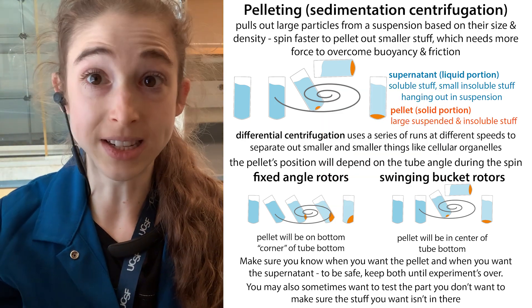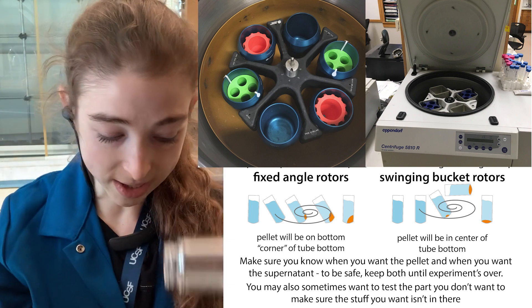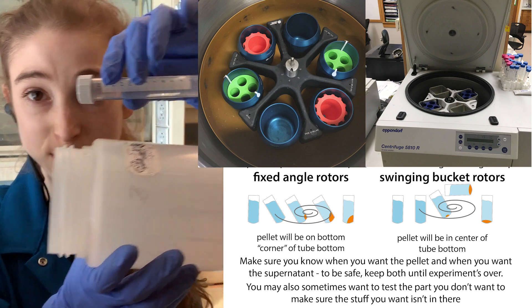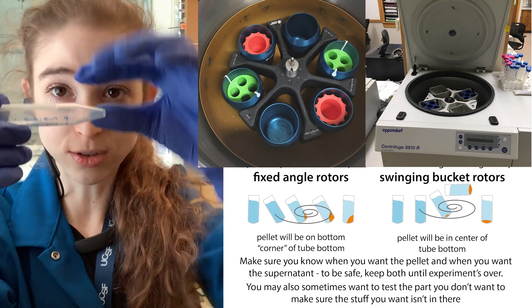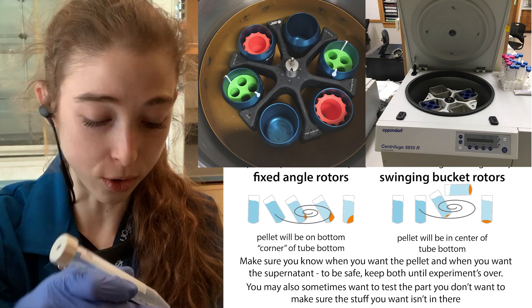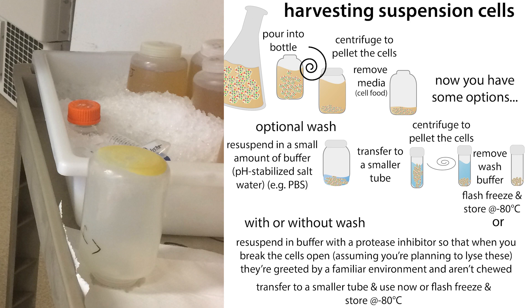If you're using a swinging bucket centrifuge, the tubes during the run actually go sideways. The force pushes things to the very bottom. In a conical tube everything collects nicely in the cone. For example, when pelleting down cells to remove them from their media, your pellet is going to be on the bottom of the tube rather than on the side.